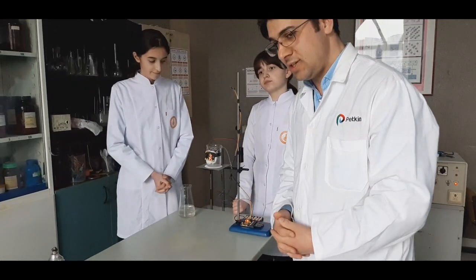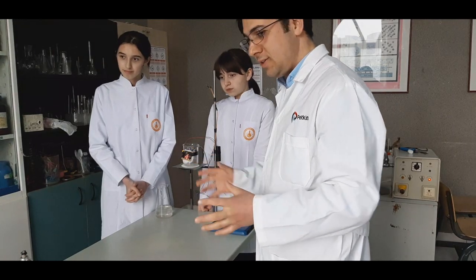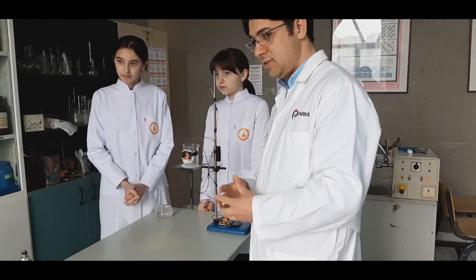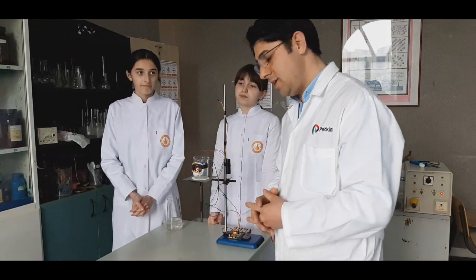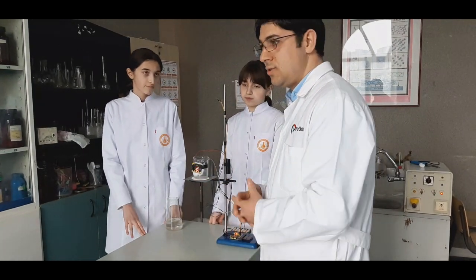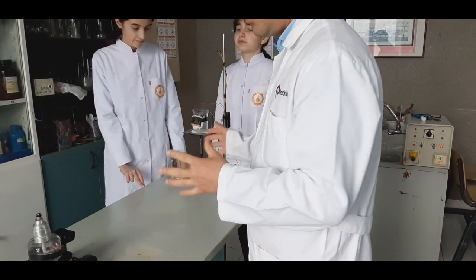This is a STEM-based chemistry laboratory. It's one part of this project. There are many different kinds of STEM-based chemistry equipment you can create, and you can use many different electronic boards. We used microbit here, but you can also use Arduino or Raspberry Pi and different electronic devices.